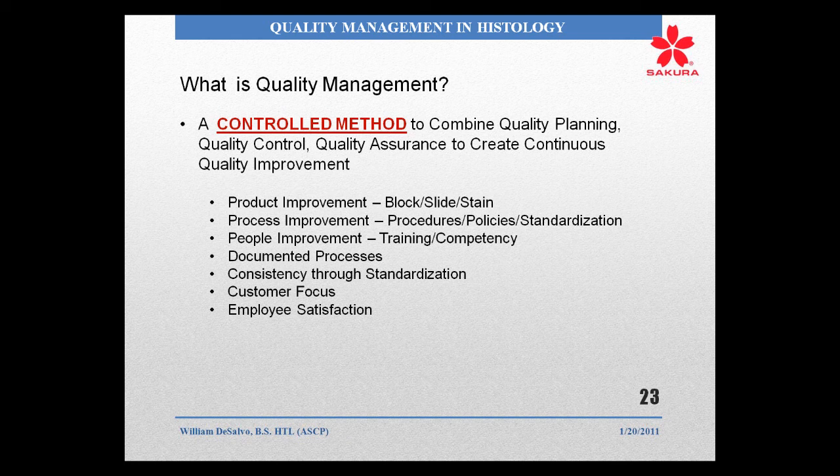It doesn't mean that you're going to have changes hourly, daily, weekly. The changes come as needed, and again, when you get ready to make a change, you have to go back into your process and look to validate that change and understand it before you make that first impression about what the change is. So again, what you're talking about with quality management systems in histology, you're talking about product improvement.